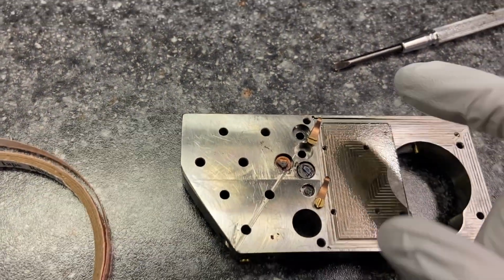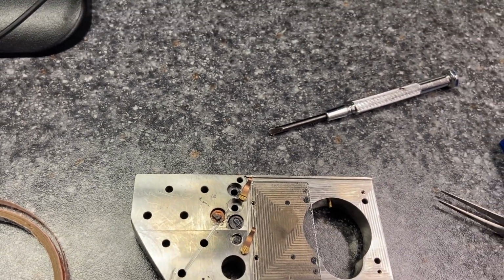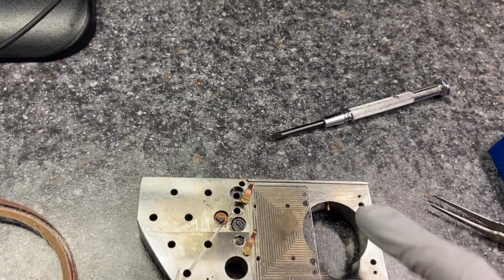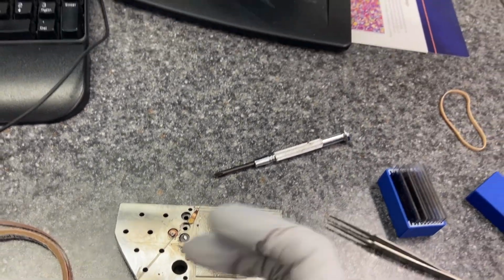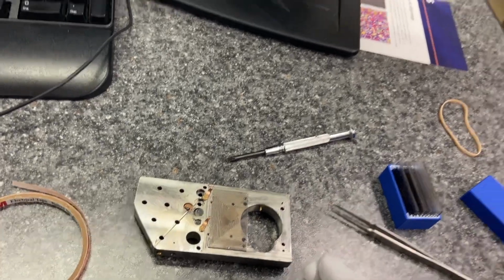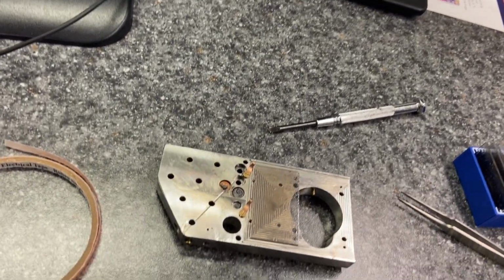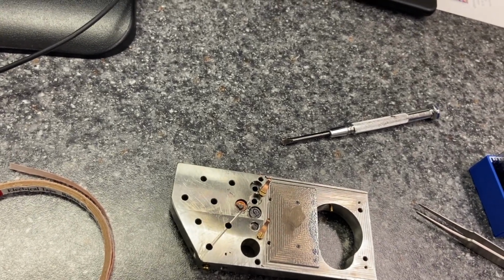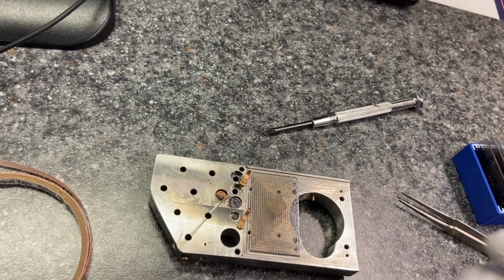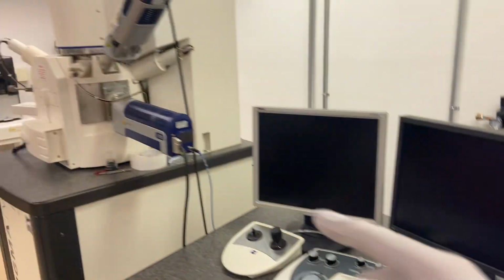So here we've deposited a very thin layer. We're talking maybe between 10 and 20 nanometers, which is extremely thin for us, but it's very important that we don't have it too thin or too thick, because electron charging is sensitive to your carbon coat thickness, as well as a whole bunch of other factors in terms of when you're trying to get good counts of X-rays and other properties. And especially it affects your signal sometimes if you're doing modes like electron backscatter diffraction.